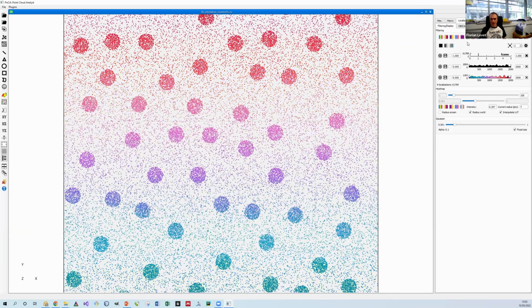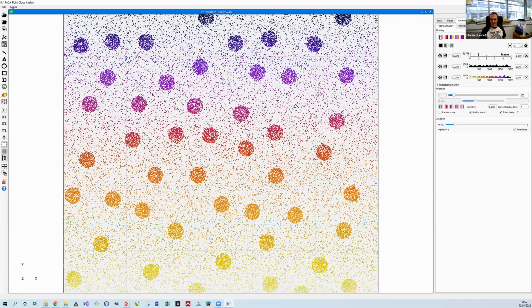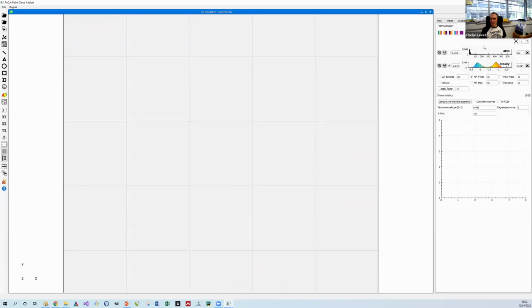And here, yes, you can change the LUT that you apply directly by clicking on the button that shows the LUT that would be displayed. So this is what you get with the filtered display localization tab. For the Voronoï, you already saw.